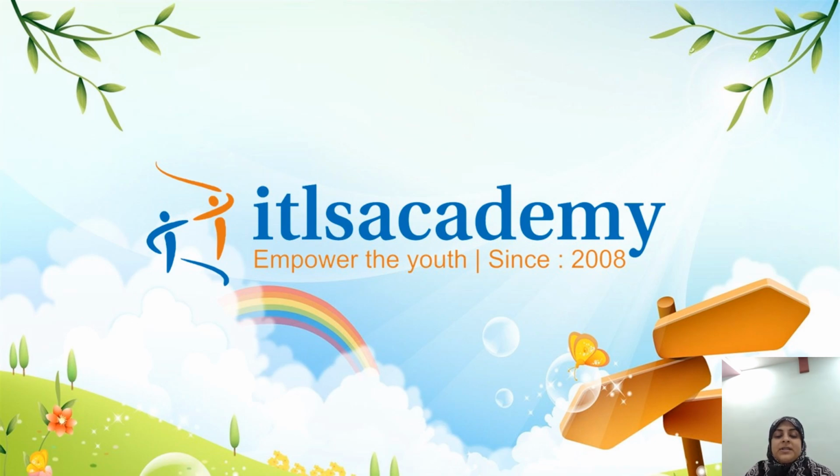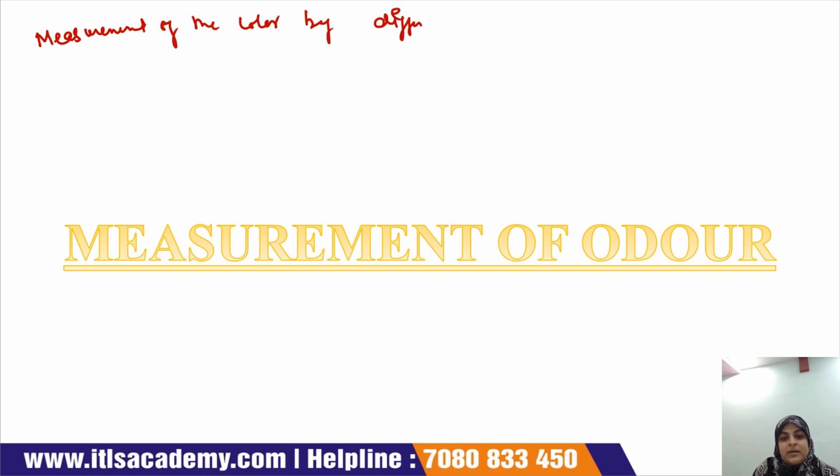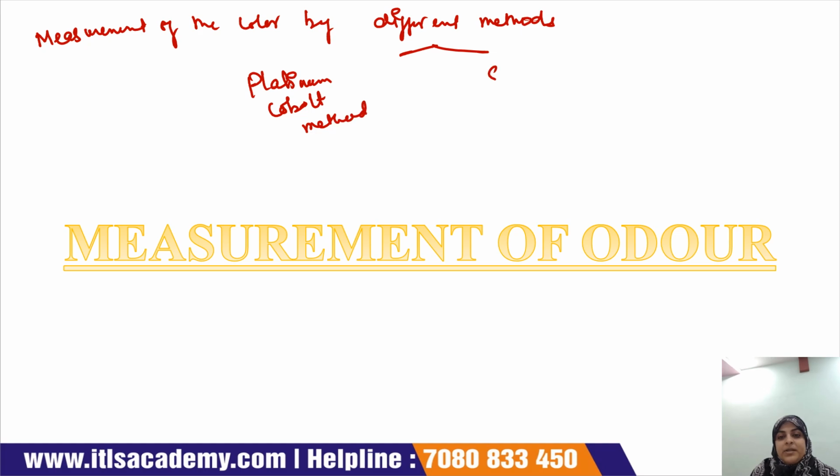Today we are going to discuss another topic, that is the measurement of odor. Measurement of color by different methods, that is the platinum cobalt method and the spectrophotometric method.